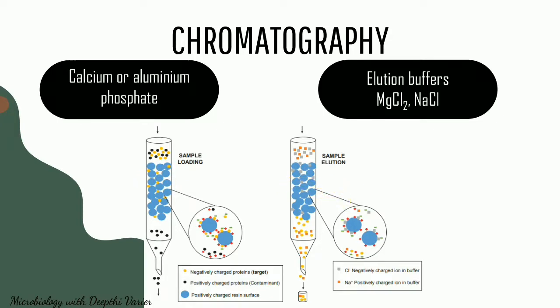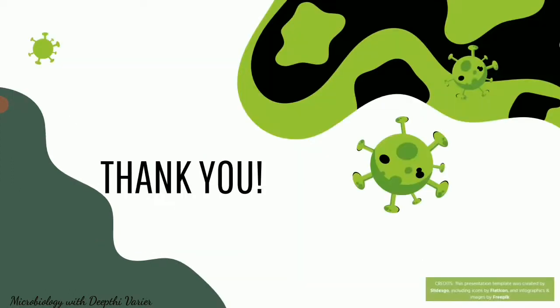So chromatography that can be used commonly is ion exchange chromatography, but we can also go for affinity or size exclusion chromatography. So these are some of the methods that can be used for purification of viruses. Each and every method has its own advantages and disadvantages. In the next class, we will look into what are the different methods for counting the viruses. Now that we have grown them and we have purified them, how do we actually measure our viral suspension?